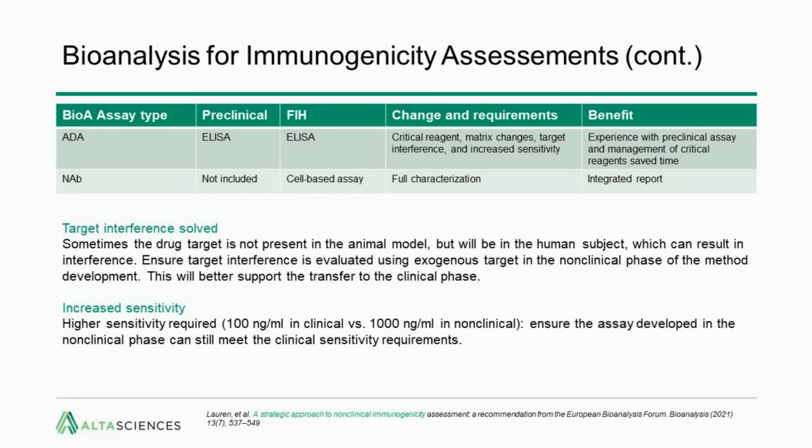Increased sensitivity was also a requirement. Higher sensitivity is required in the clinic versus non-clinical studies, and we were able to save time by ensuring the assays developed in the non-clinical phase can still meet the clinical sensitivity requirements.